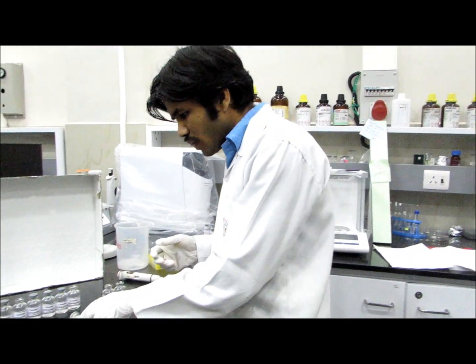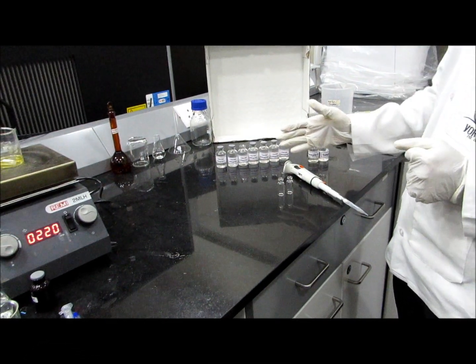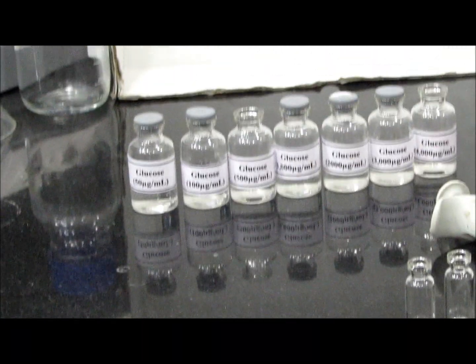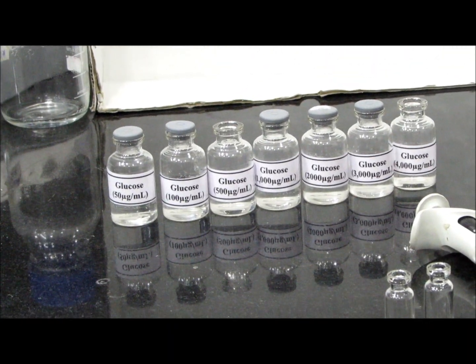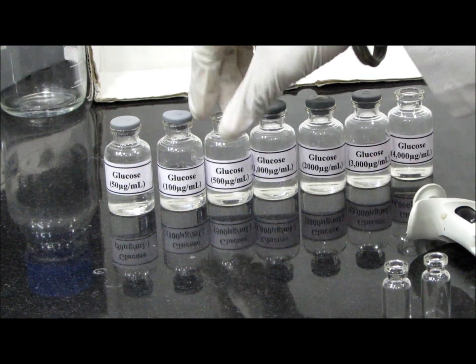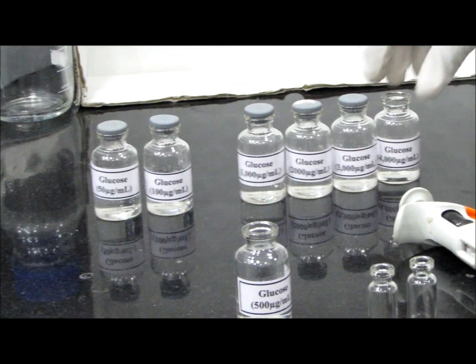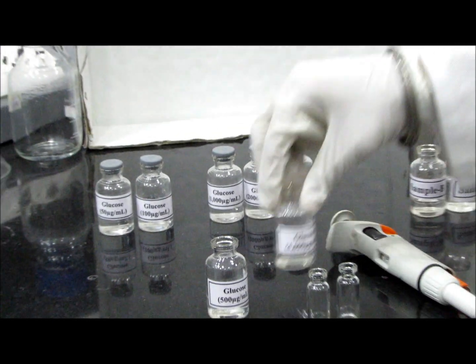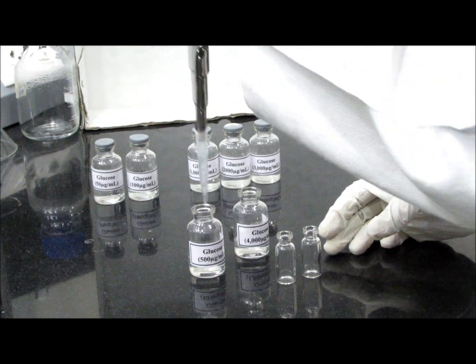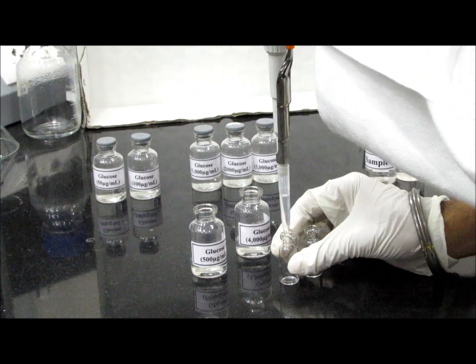Let us take 1 ml of this standard glucose solution. The first 3 glucose standard solutions represent the saliva concentration, and the other 4 represent the glucose concentration of blood and urine. Let us take 2 concentrations from this standard glucose solution. We are taking 500 microgram per ml and 4000 microgram per ml. Now let us add 1 ml of each glucose solution in this vial.